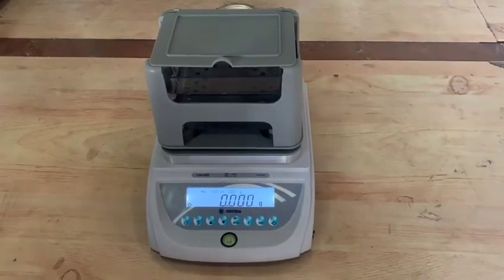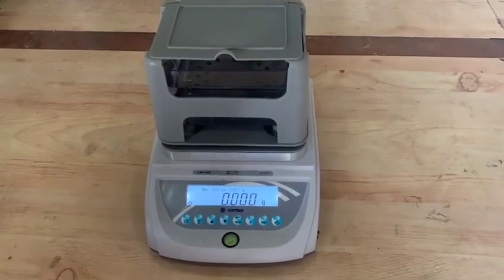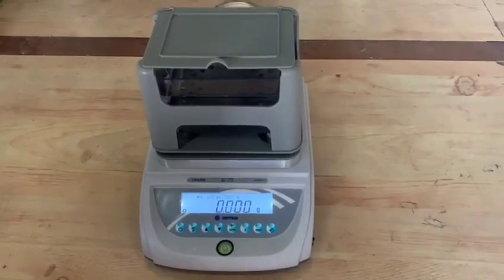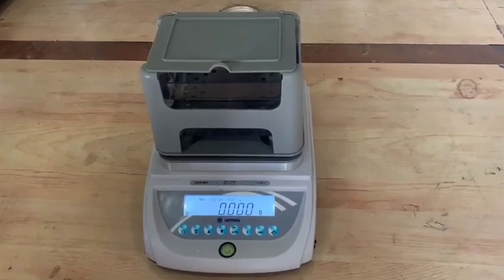Gold Purity Checking Balance: Purity of gold can be checked by determining the density of gold based on Archimedes principle, incorporating a high precision electronic balance.